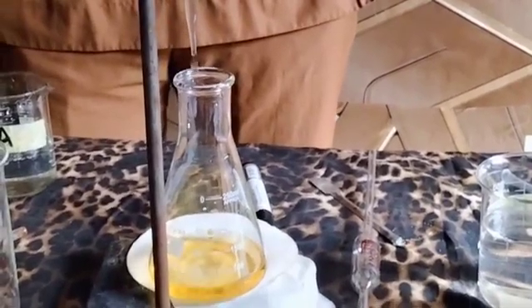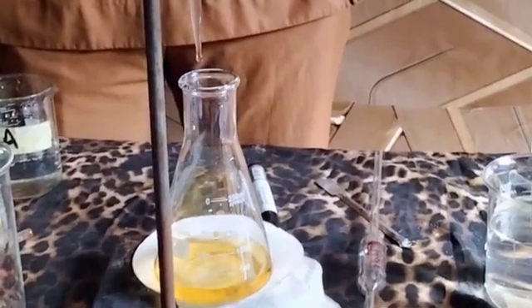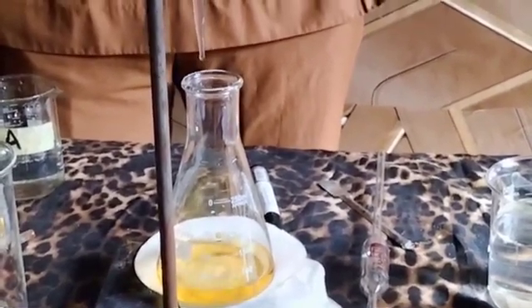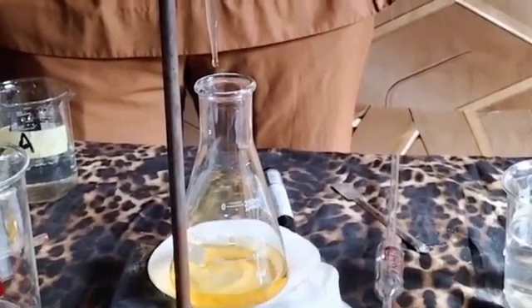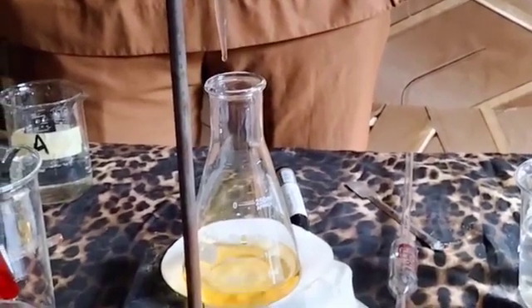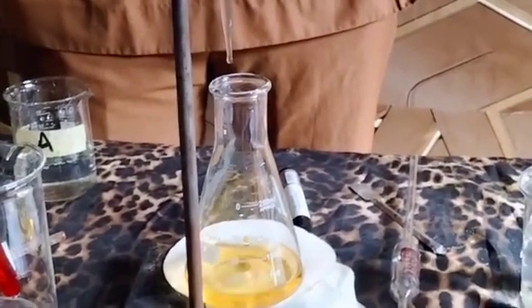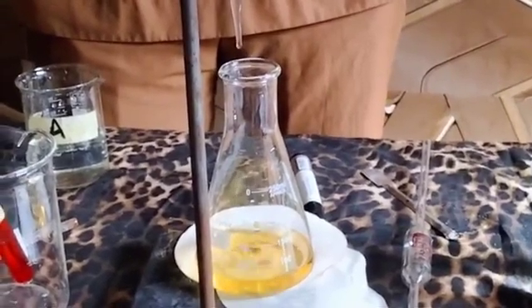So you also make sure you place a white tile under the conical flask during titration. The white tile ensures accurate color change. So the white tile gives you sharp color change. So when there's a color change, it reflects instantly on the white tile. So these are some of the precautions you observe while doing titration experiment.